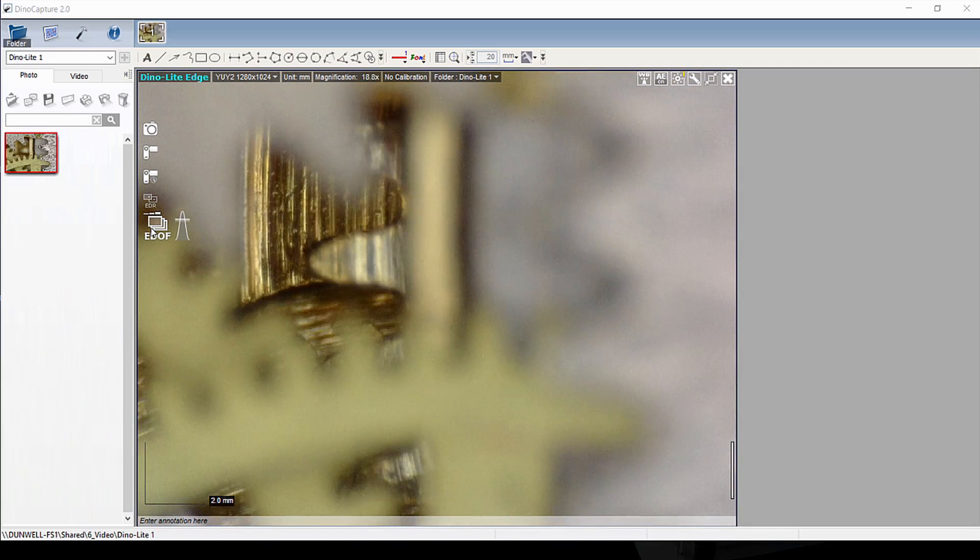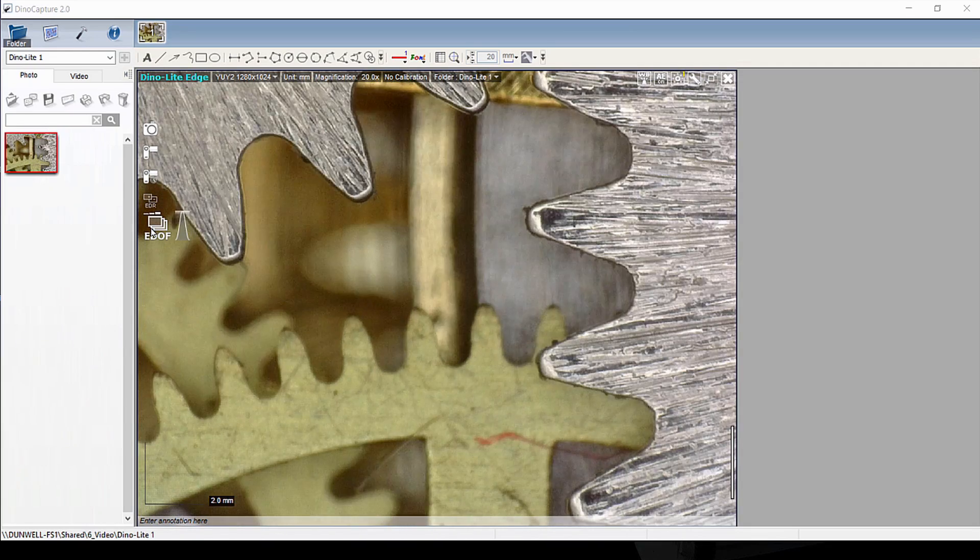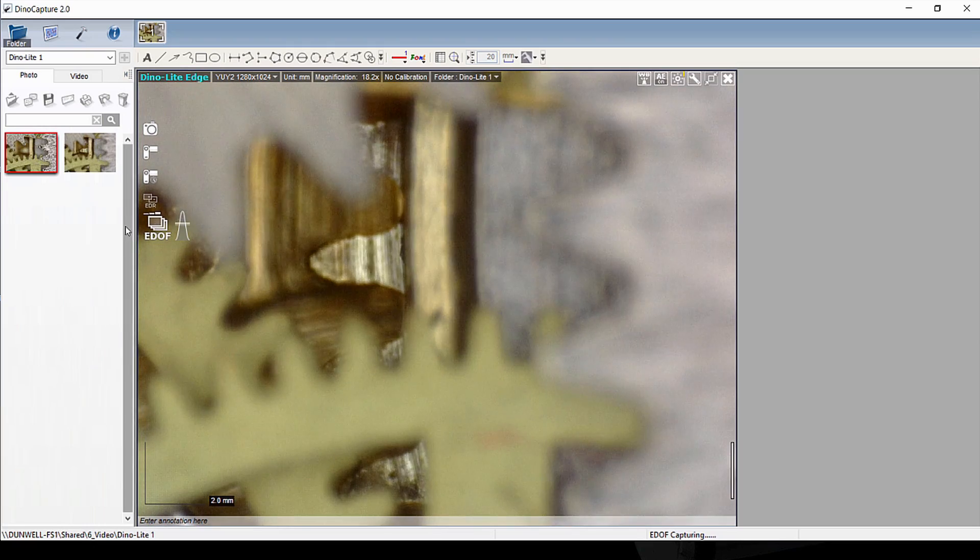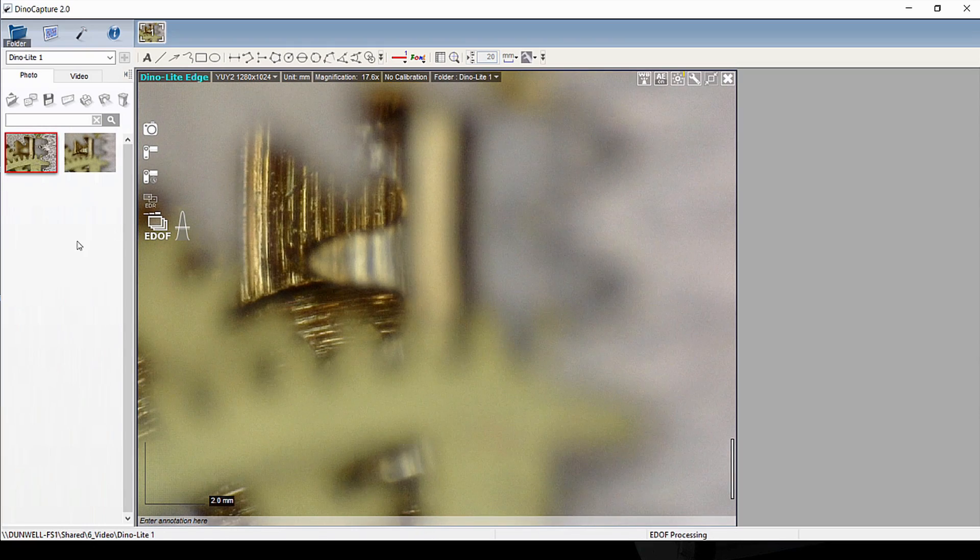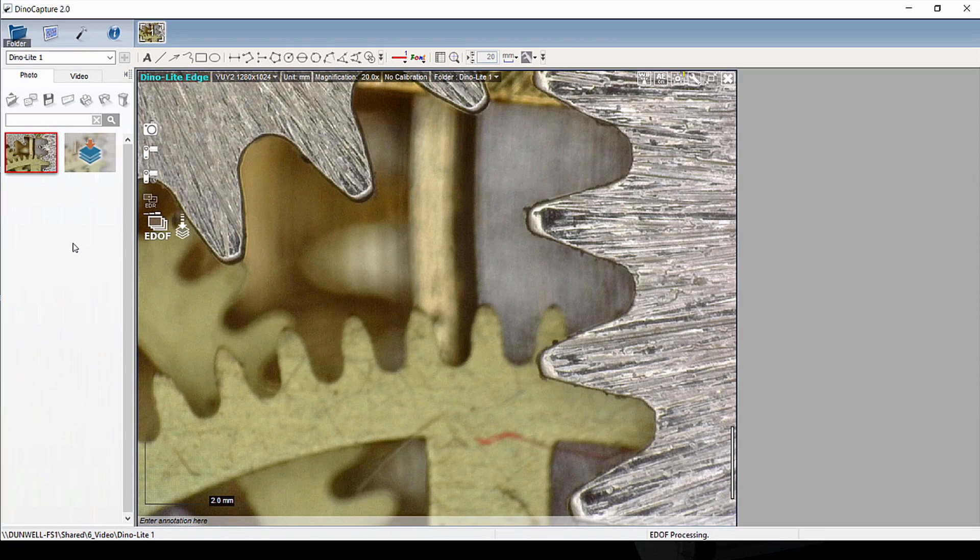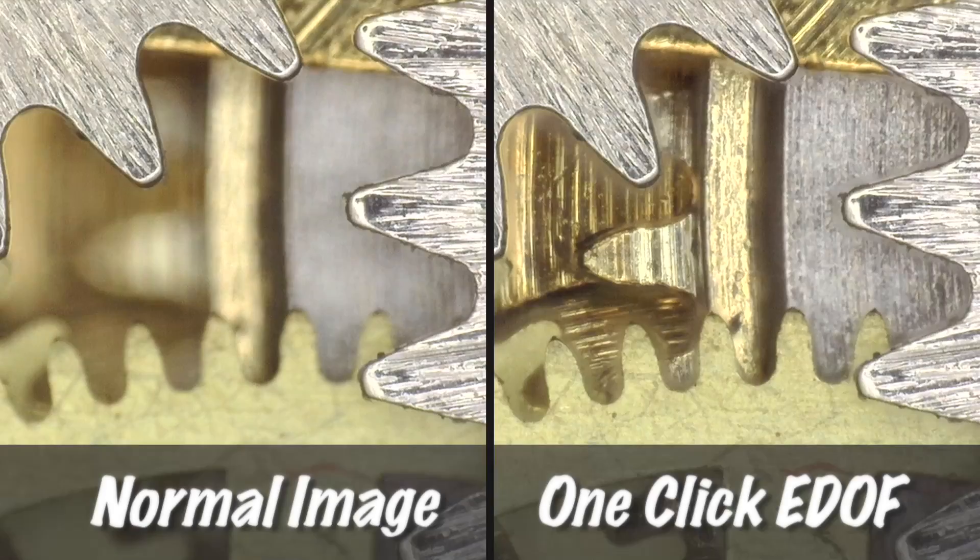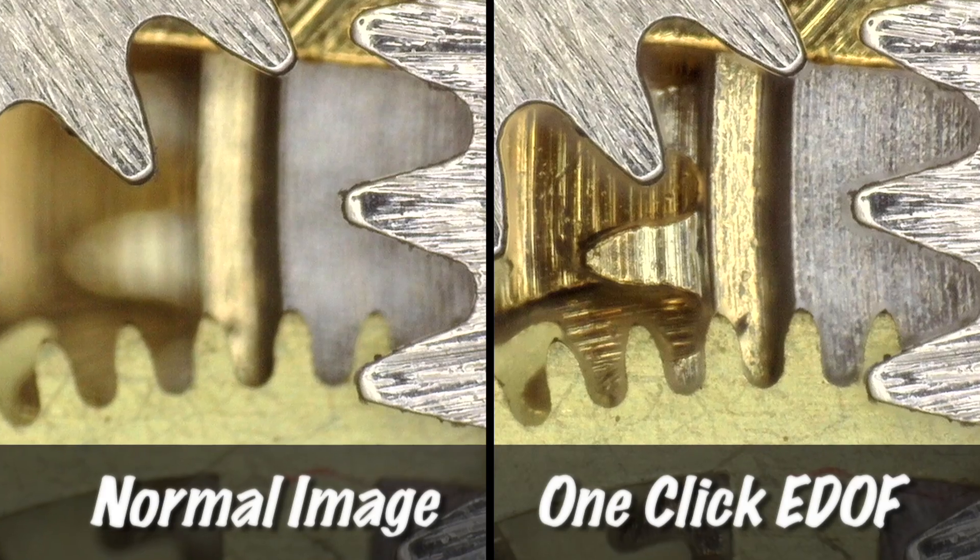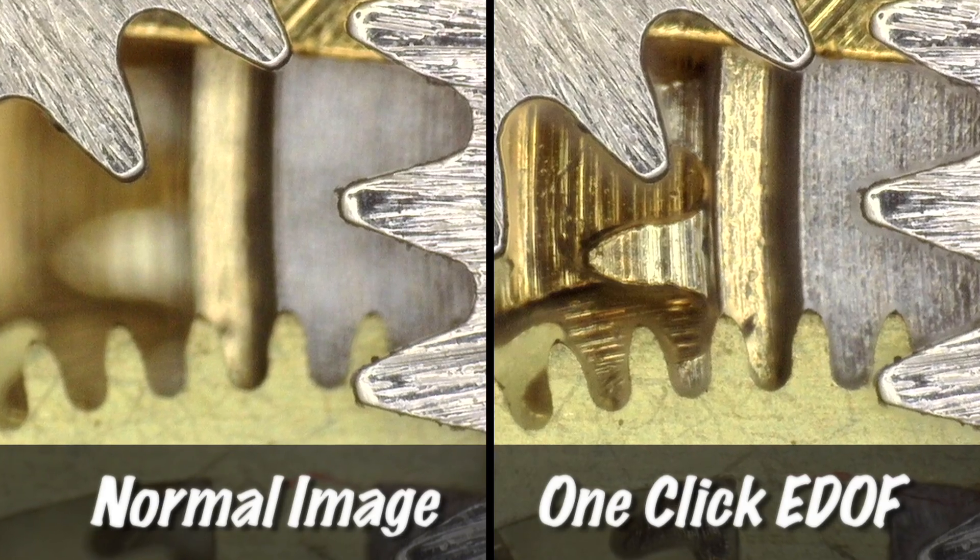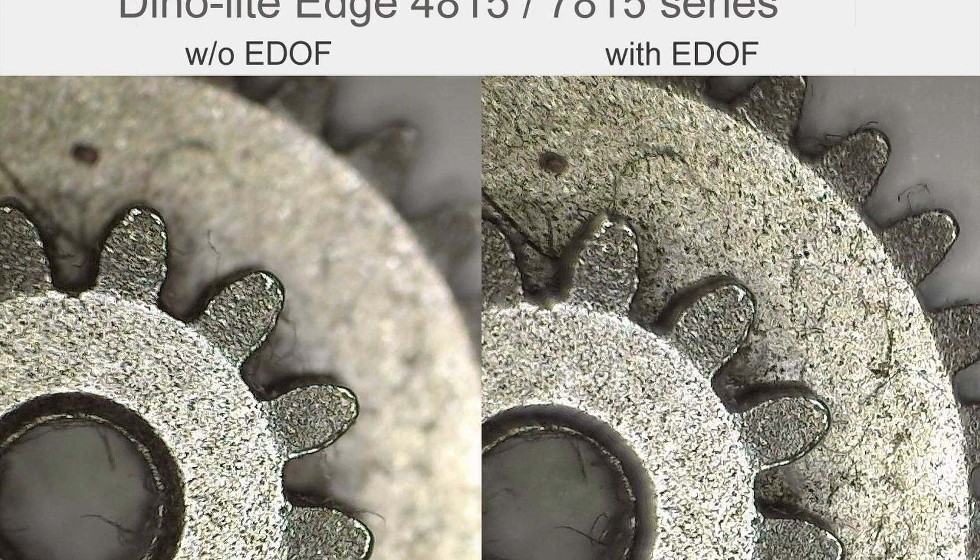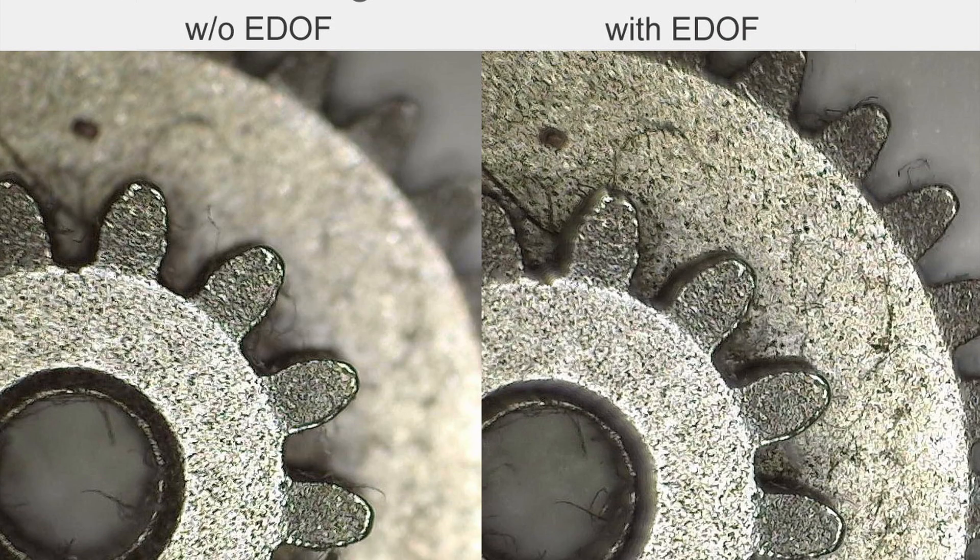Extended depth of field or EDOF is a feature on compatible models which provides simple one-click focus stacking. Users can capture multiple images using auto or manual mode at different depths and the software will automatically combine them into one clear image.